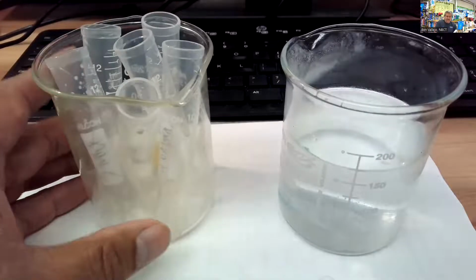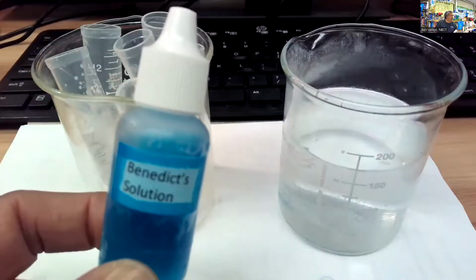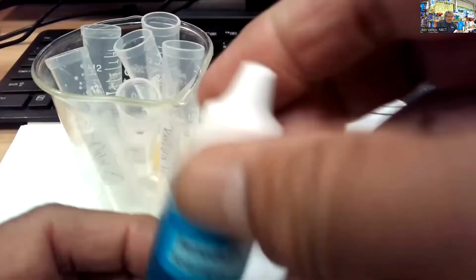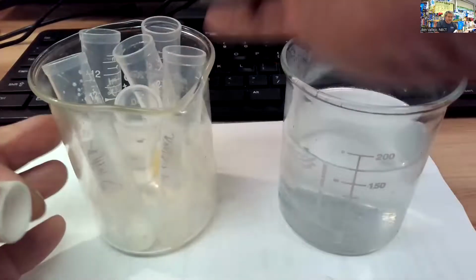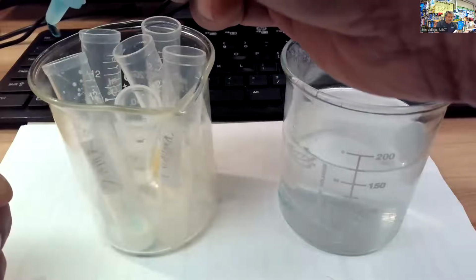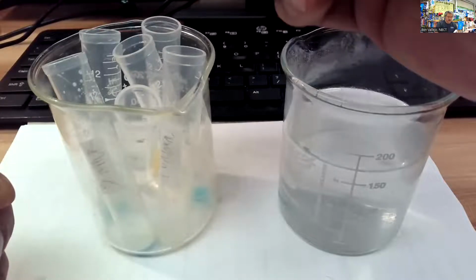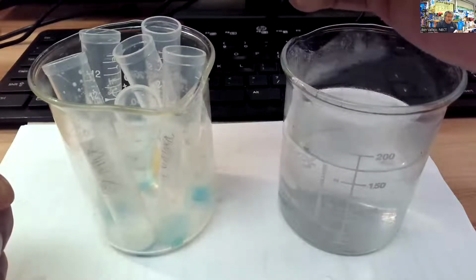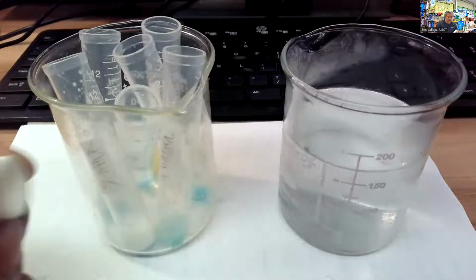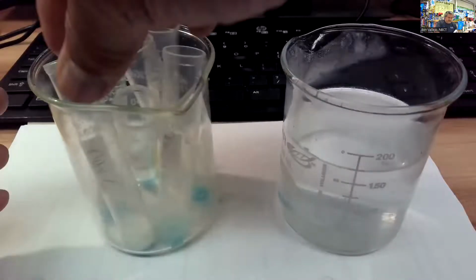I'm going to add 5 drops of the Benedict solution. Remember, we're looking to see if it might turn orange or yellow or red, even green. So let's take the cap off of the Benedict solution, add 5 drops to each. 1, 2, 3, 4, 5. Each tube gets 5 drops. Good. All right, so now we have the Benedict solution in all 6 test tubes.